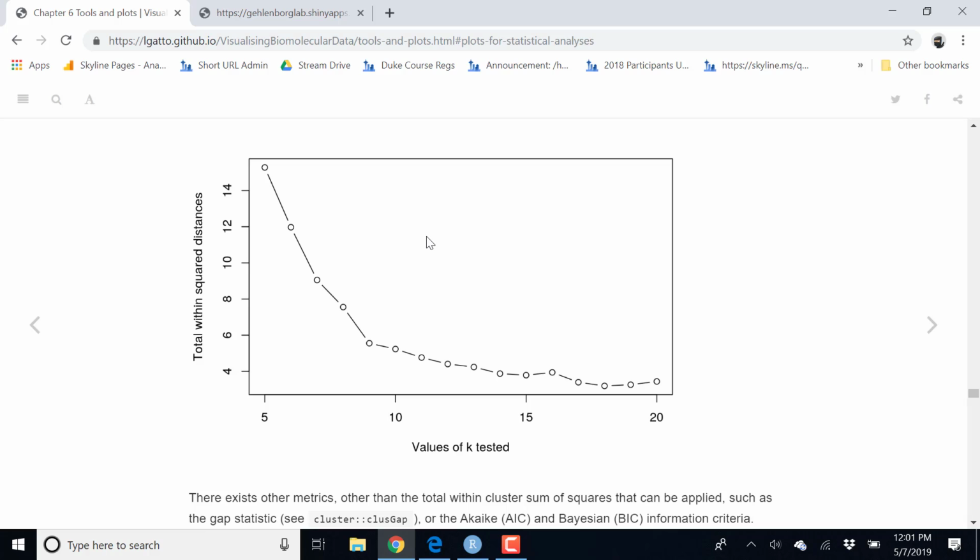And let's not forget that these clusters are very often a representation of our understanding. These are quantitative data. There is no guarantee that these data, which contain a lot of noise, will actually perfectly cluster into a certain number of clusters. We always have points that are a little bit noisy in between. But this will give us a good idea.